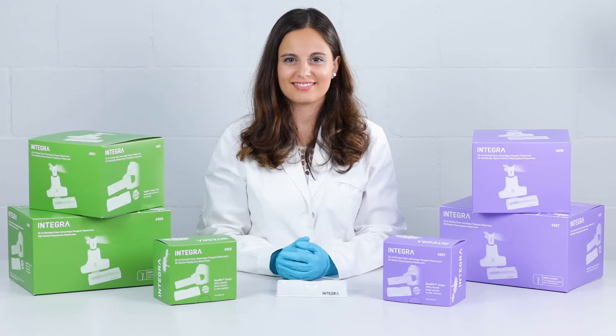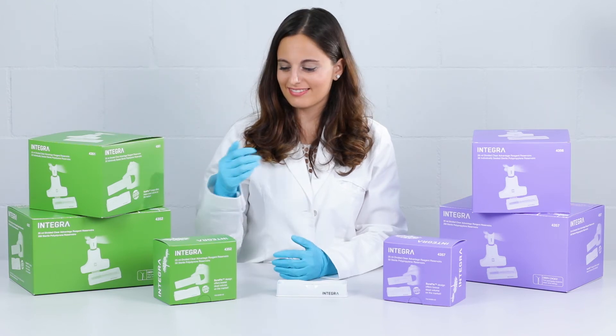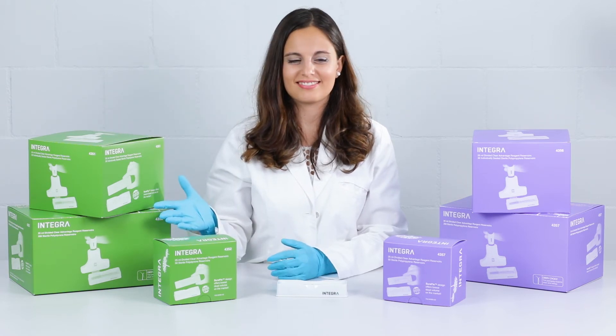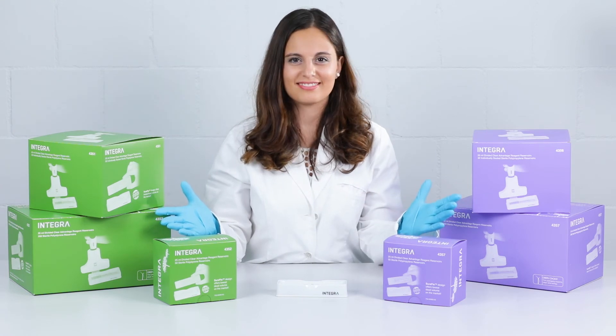New 25 ml divided reservoirs are available in polystyrene or, for improved chemical compatibility, in polypropylene.